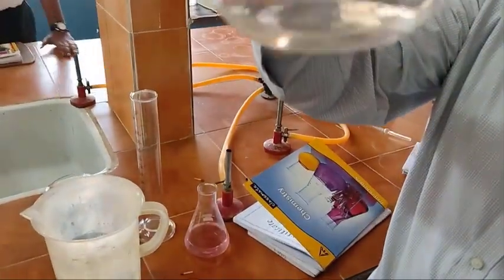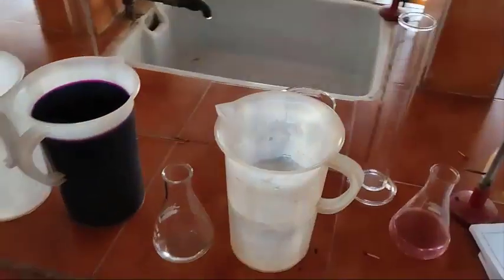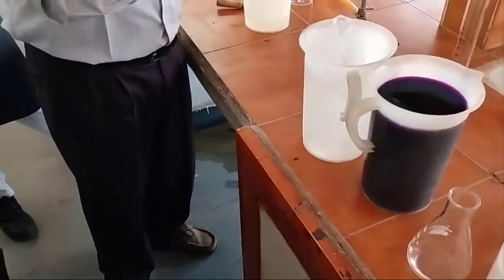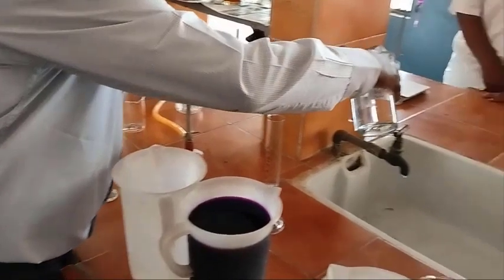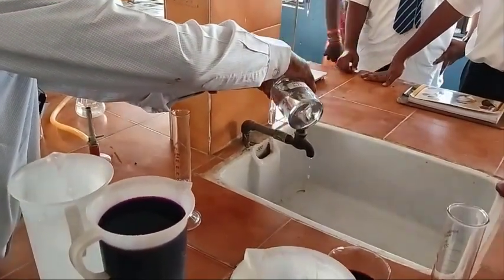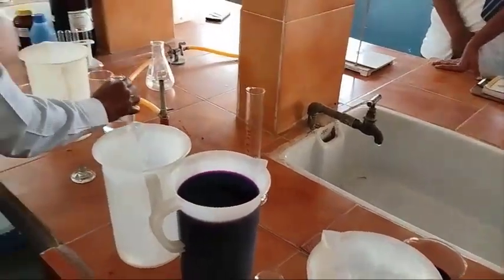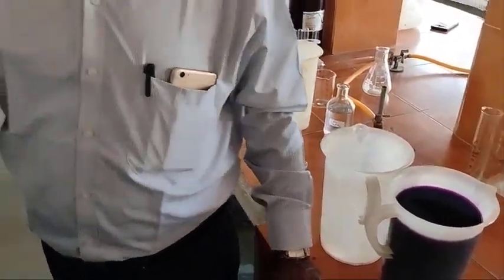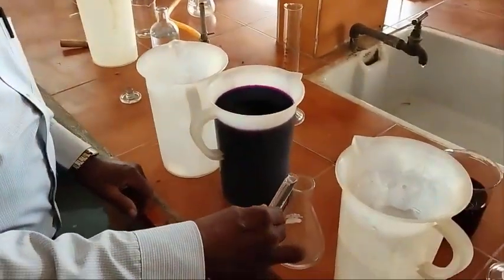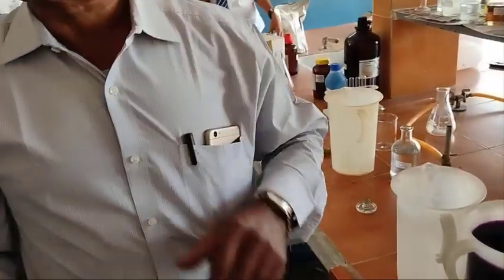Leave it. To this 20 ml of oxalic acid, add 1 test tube full of dilute sulfuric acid. Here it is, the dilute sulfuric acid. 1 test tube full of dilute sulfuric acid is around 16 to 18 ml. So add this. Why should we add dilute sulfuric acid? To prevent the hydrolysis of the substance which is to be titrated.